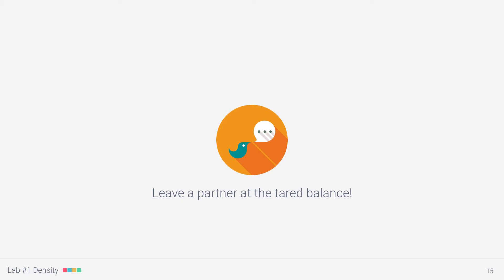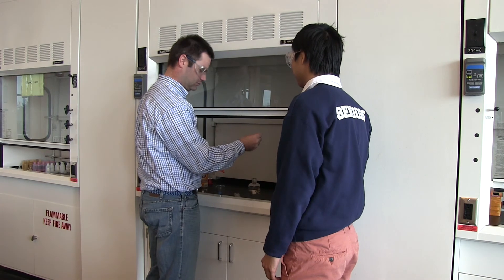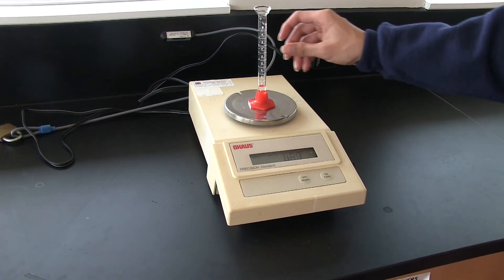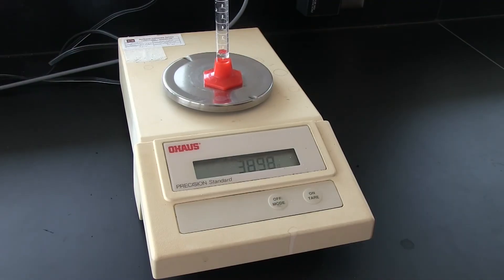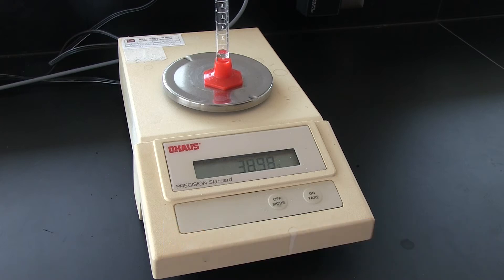You should have been assigned a specific volume of liquid ethanol to collect. Once your teacher gives you your sample, head back over to your tared scale and place the cylinder with the sample on the scale. The number displayed is the mass of the liquid sample only. By taring, the scale already subtracted the mass of the empty cylinder.